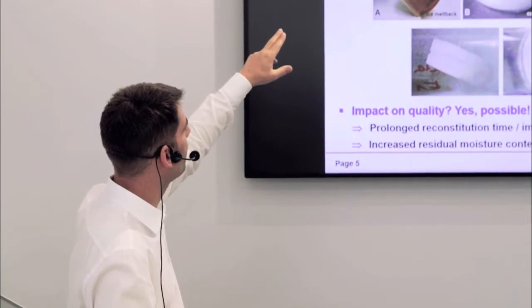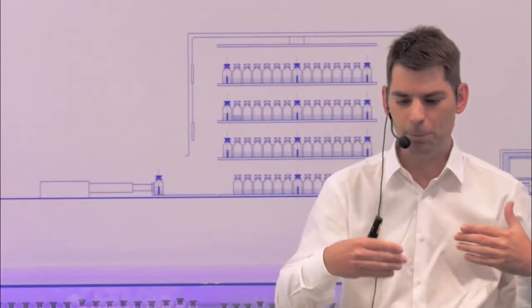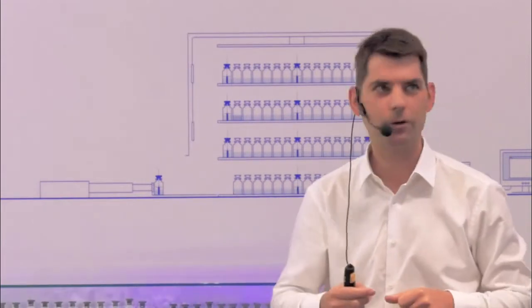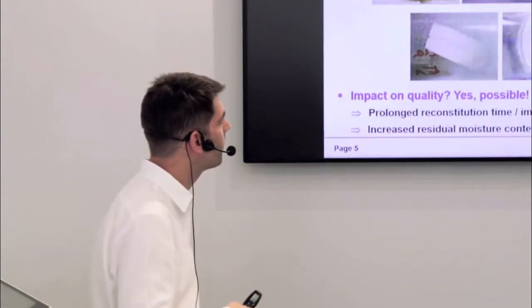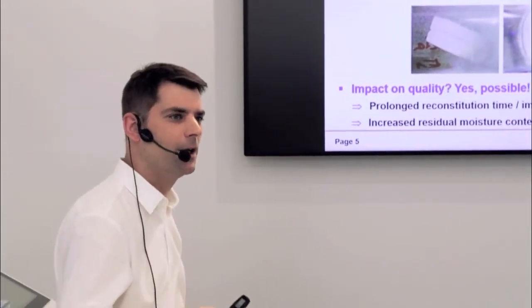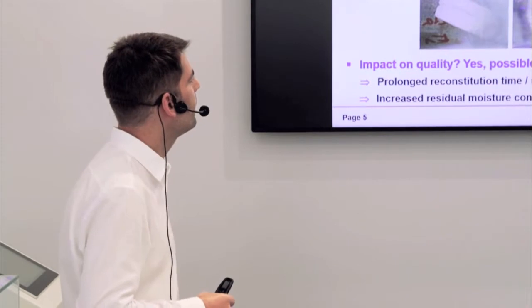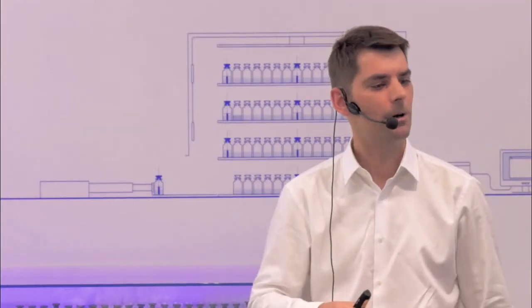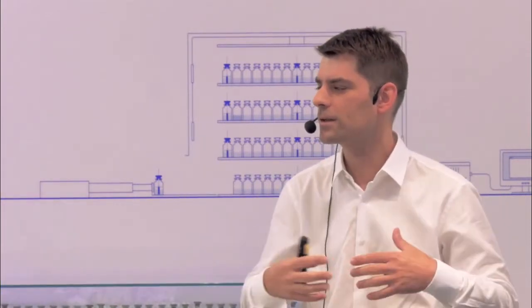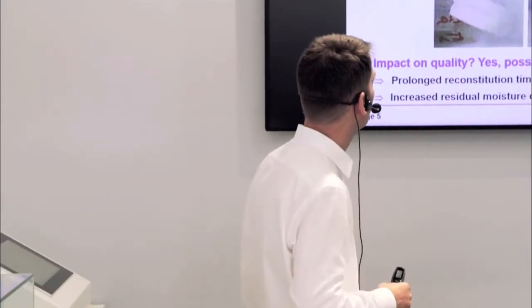So the first bullet point, meltback. Meltback is related to being too early in your change from primary into secondary drying conditions. Once ice is left in your product during primary drying, once your endpoint determination of primary drying is not, let's say, is imperfect, is not appropriate by whatever technology determined, you might ramp into secondary drying. There's ice left, and this ice simply melts, and you create holes and product defects in your cake.